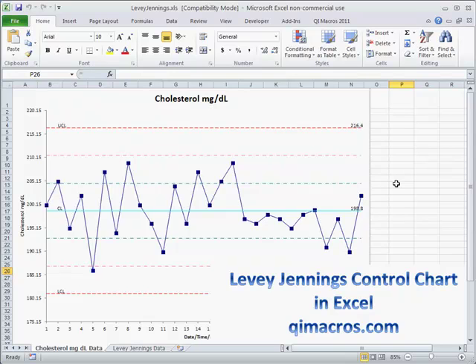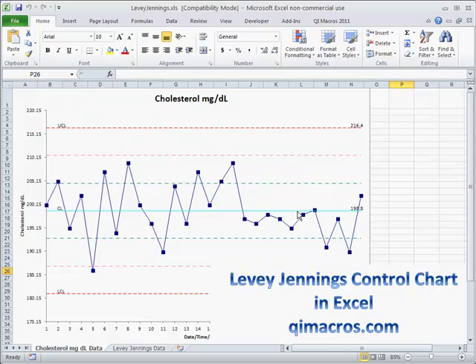Another type of control chart is the Levey-Jennings control chart. This gets back closer to the original idea of three standard deviations because it actually uses standard deviations to calculate limits. This is often used in laboratory settings.